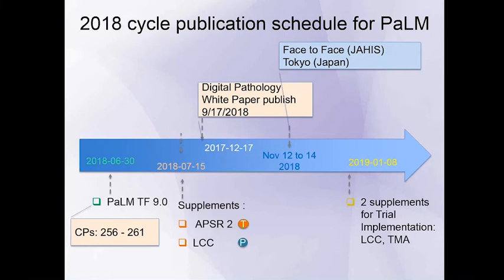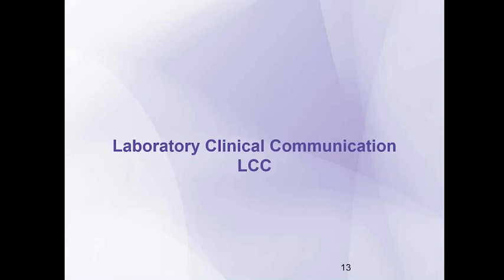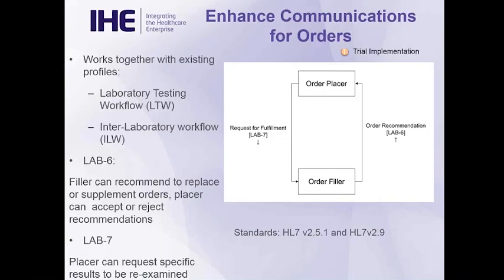Next slide. So now we're going to focus on the newly published supplements. The first one we're going to look at is the Laboratory Clinical Communications Profile, or LCC. So this one is enhancing communications for orders, and basically it is an additional profile that works with either the laboratory testing workflow, which is inside a hospital, or the interlaboratory workflow, which is contracting out with laboratories.